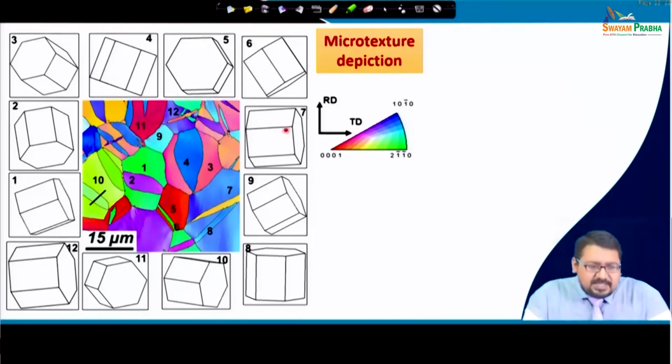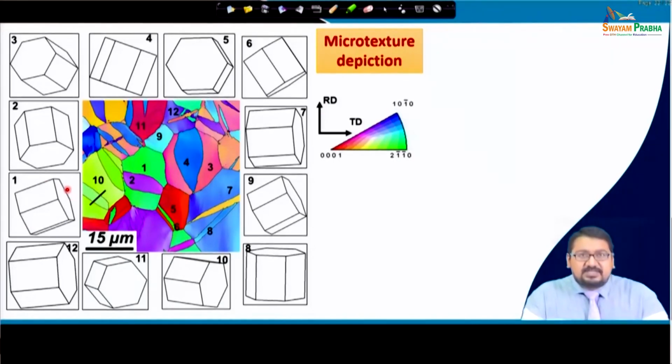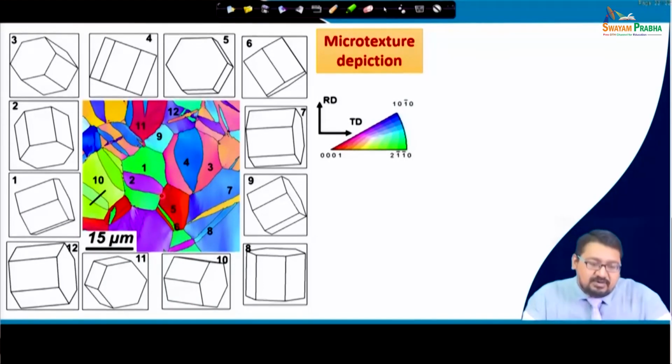Now, you see that this orientation is represented in terms of unit cells, and this hexagonal unit cell can be obtained by using this EBSD method. Like that, we can observe the twin that has formed. I know that it is a twin which has formed in grain 1, and we have nomenclated it as 2, and you can see that the unit cell is sufficiently different from grain 1.